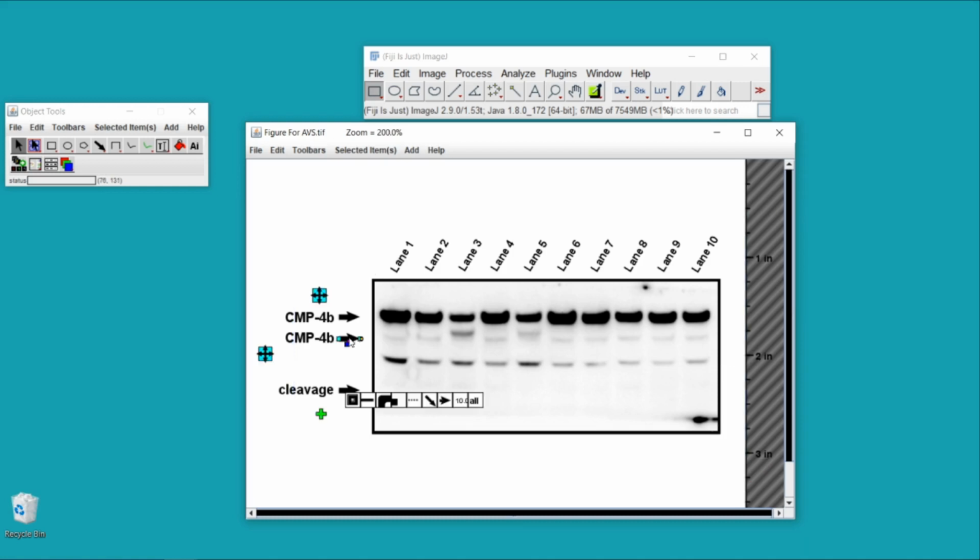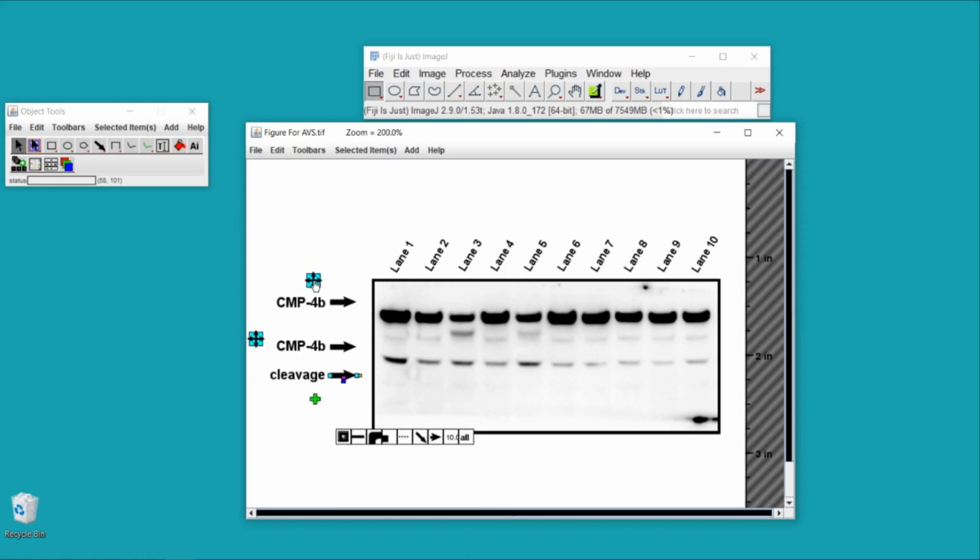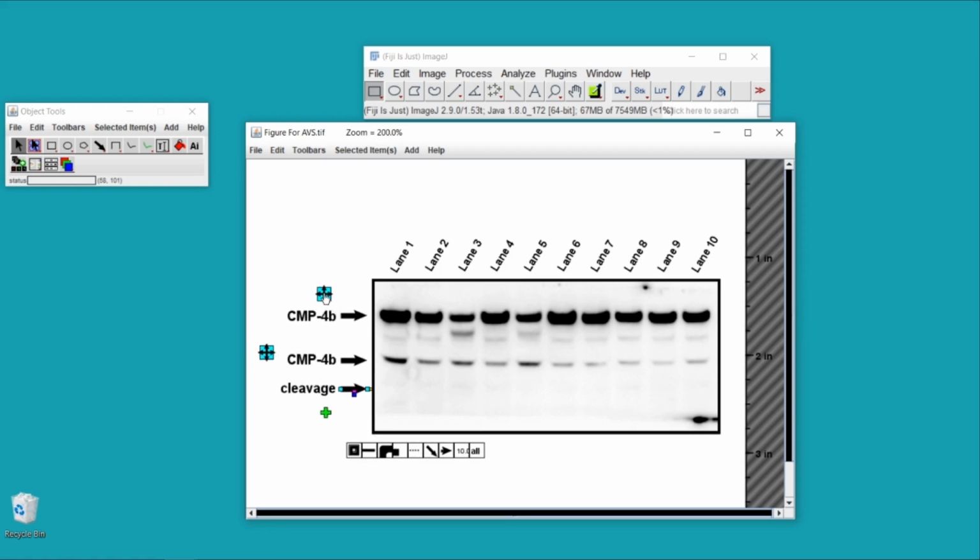Most obviously, when you're moving one around, there's a line that helps you align it to specific Western blot bands. Also, when you drag the handles on one of these arrows, you can adjust all of them uniformly or move this bundle as a group to keep everything nice, consistent, and perfectly aligned. You can drag one of these labels and they all move.